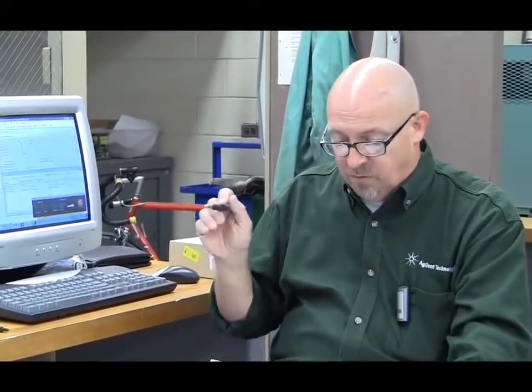If you start losing sensitivity on everything, that's CO2, and that's harder to get rid of. The main thing we want to do is make sure we get CO2 off of that, keep it off of that, which shouldn't be hard to do at 10%. The other column is specifically, because it's got a little pre-column on there, and we hold up the CO2 just briefly, and then we back flush it to vent.